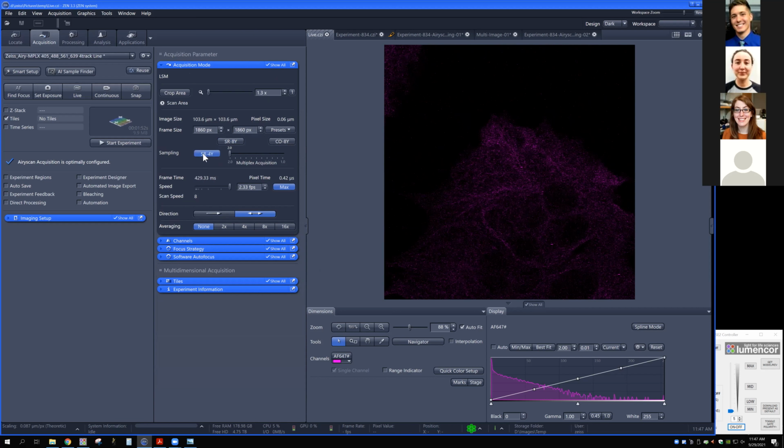The 4Y mode is the one that doesn't use a beam shaper, but we're still using a spot pattern of excitation. If I want to use that mode, I just check this one. If I want to instead use the beam shaper to do 8 pixels at once to go even faster, I can choose this one here. And you'll notice that when I do that, the frame size is going to stay the same because we're sampling at 2 times Nyquist for each one of these.